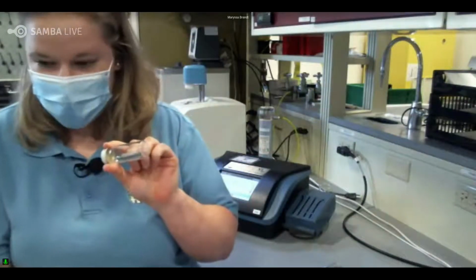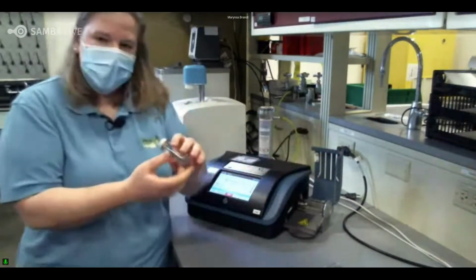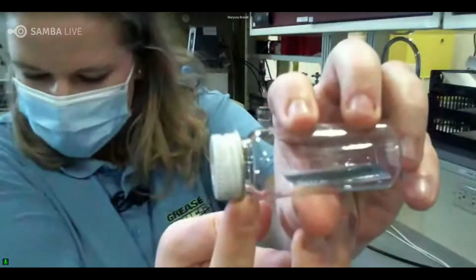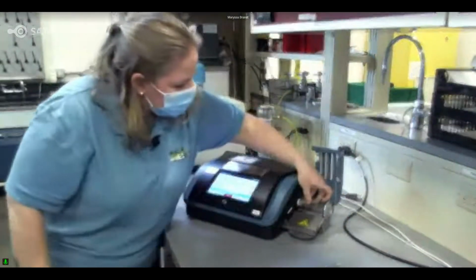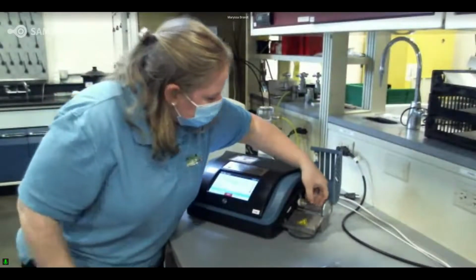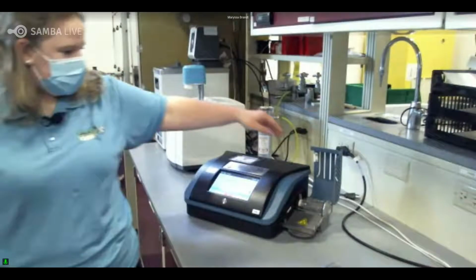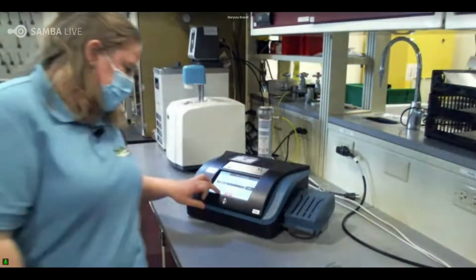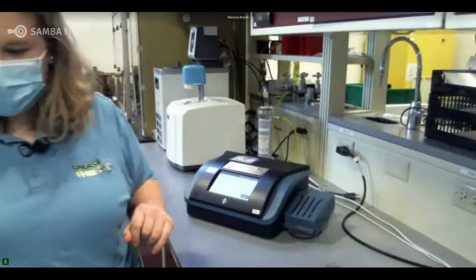It's now ready to go in the instrument. So we're just going to lift this up right here, and the cap, there is a little ridge right there that's just going to sit right on the Vapor Pro. So we're just going to put that right in there, and it's just sitting there, ready to be tested. We're going to put the lid down, and for this, we're going to choose the grease method, and now it's asking me to enter the weight.